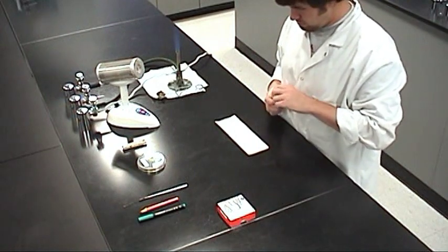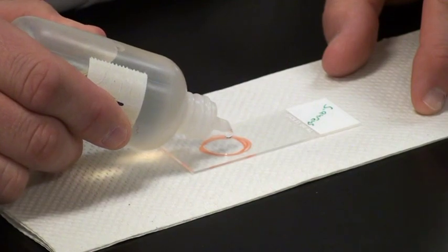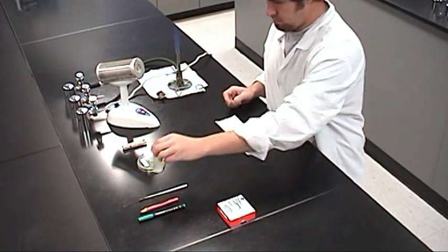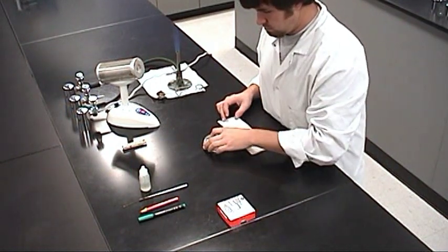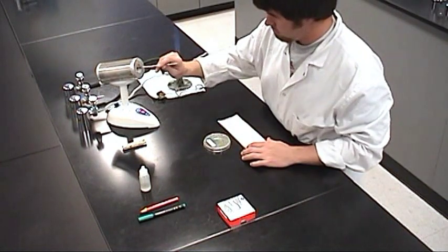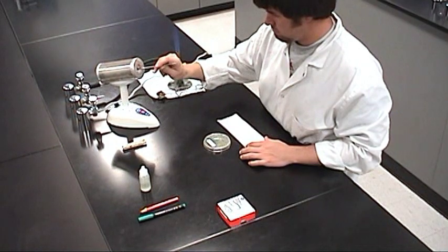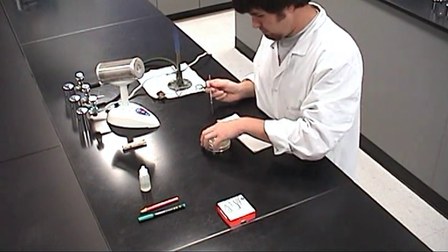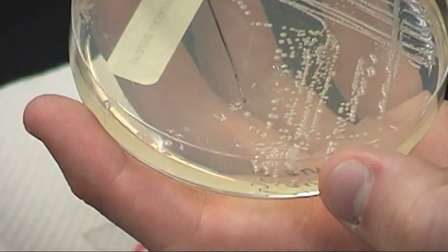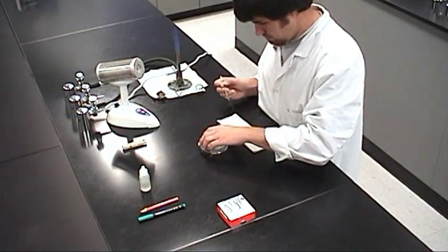Use the water dropper to place a very small drop of water on the top side of the slide over the target circle. Next, use the inoculating needle to add the specimen sample. Before taking the sample, flame the needle in the incinerator for at least five seconds to sterilize it. Hold the inoculating needle in one hand and pick up the culture plate with the other. Take a small sample with the tip of the needle, then place the plate back into its lid.